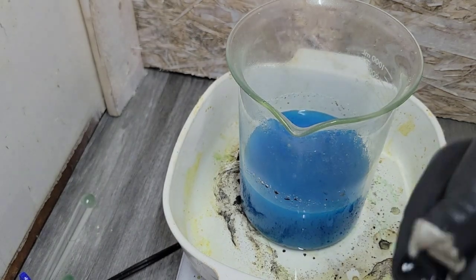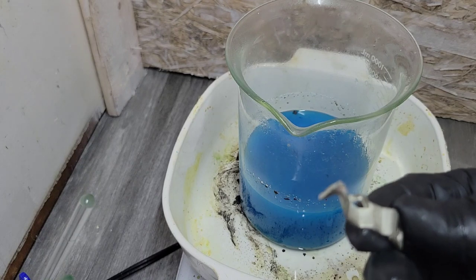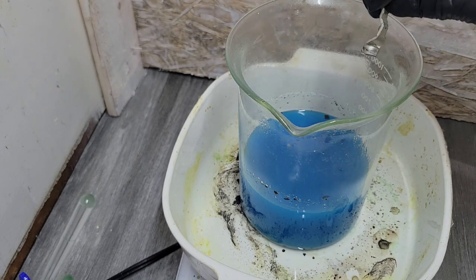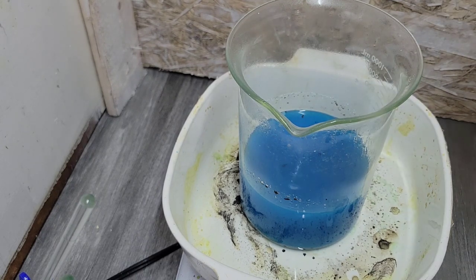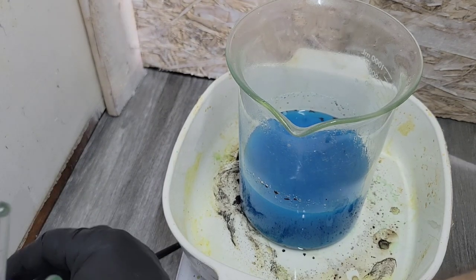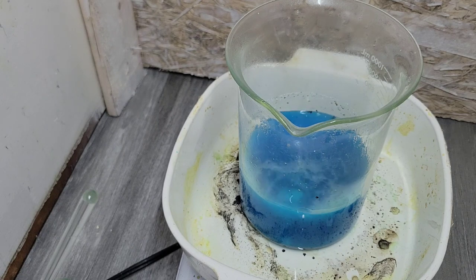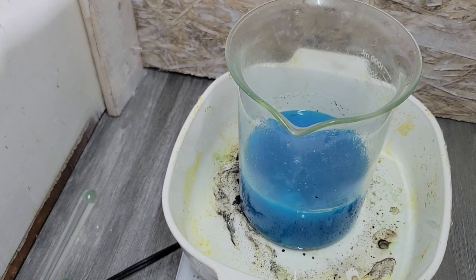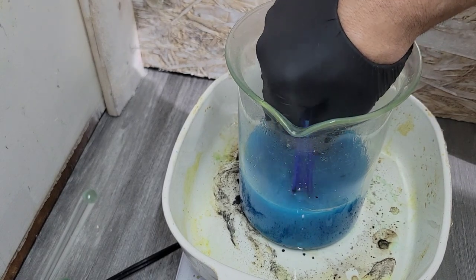So these are the questionable ones. What are they? So if it's zinc, it's going to drop out the copper. Well, if that's the case, then we're going to have to add some more nitric to dissolve what copper has been cemented. Well, it'll also cement out the silver. So let's do one of these at a time. Vigorous reaction. Just watch for the color to start to turn brown. That'll give us a decent indication.